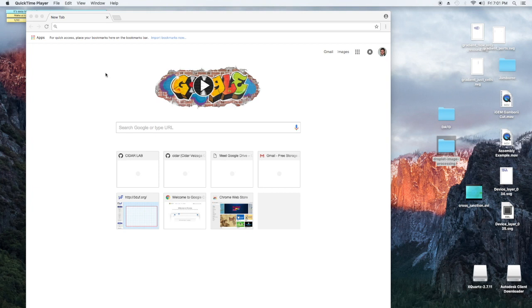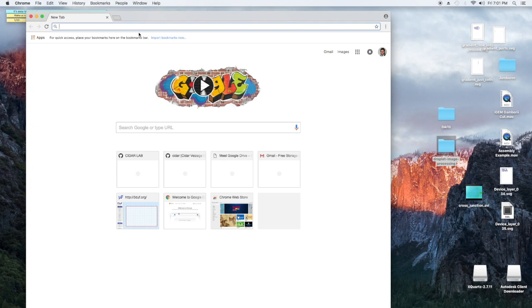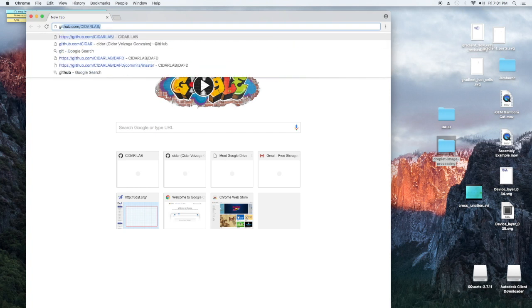Hi, I'm Rodriguez, I'm the developer of Udrop and I'm going to give you guys a walkthrough on how to use it both as an end user and how to expand on it as a developer, showing you the front end and the back end. So let's get started.